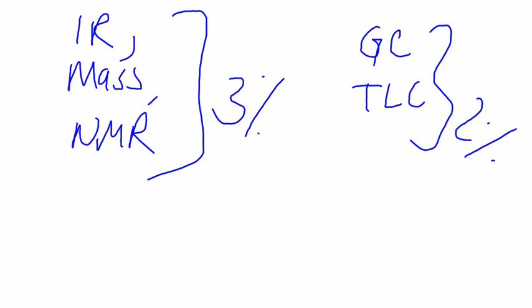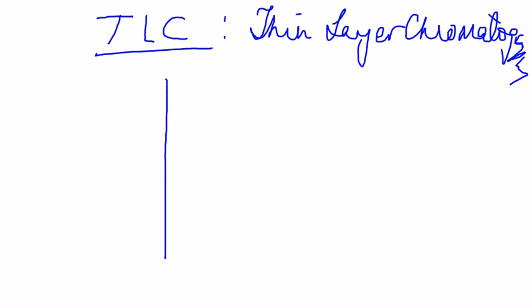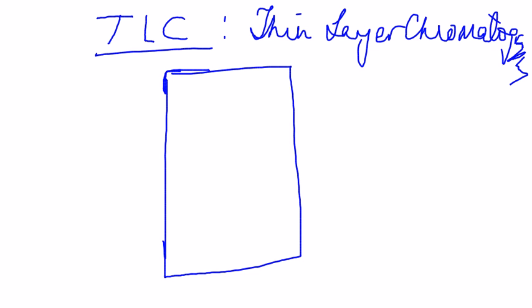For the TLC, there is a video that you have to watch, and a handout that gives you the entire procedure and all of that. I'm just going to cover the very basics of what's expected of you in the TLC part. So let's talk about the last bit, which is TLC. TLC stands for thin layer chromatography. What you will be given is a TLC plate, and these are pre-cut for you, so you don't have to worry about that. You will be asked to run a TLC and figure out the nature of your unknown sample.